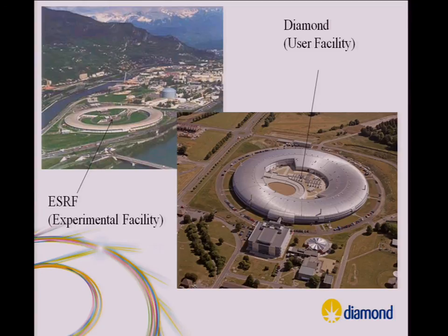Yeah, I mean, I said at the start that there are other applications which we make on site, but they need visualization as well. So we have the data analysis algorithms needing visualization, but we also have the data collection. When that runs, it produces one-dimensional data most of the time, and they need to see a real-time plot of that kind of stuff. So for perhaps something like medical MRI, it would have the same type of application? Yeah, it's not used in that scenario yet, but there's no reason why not.